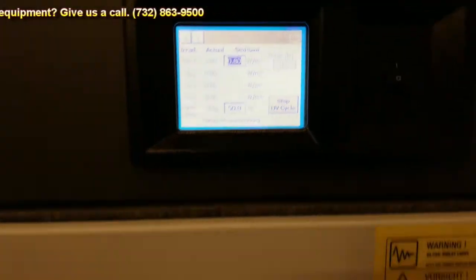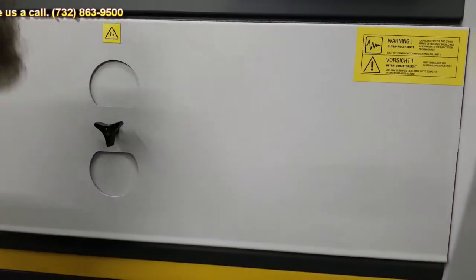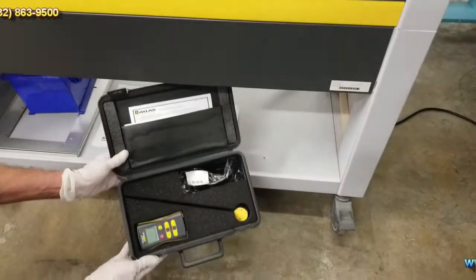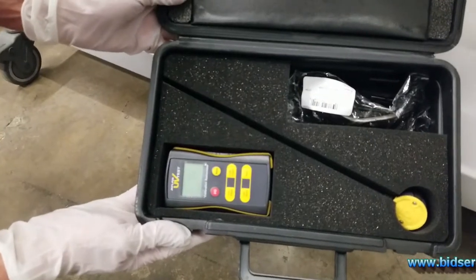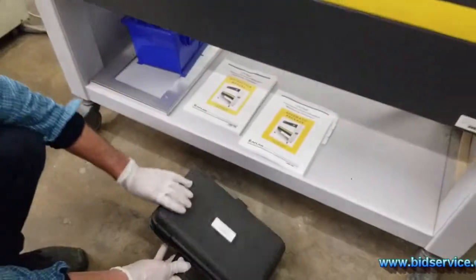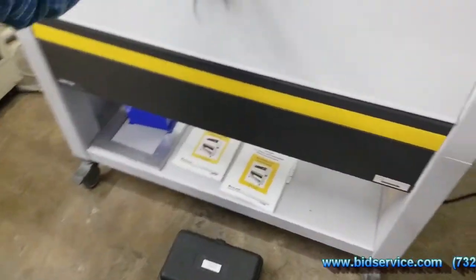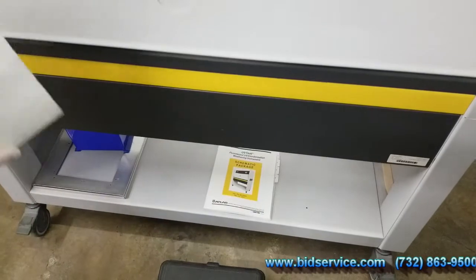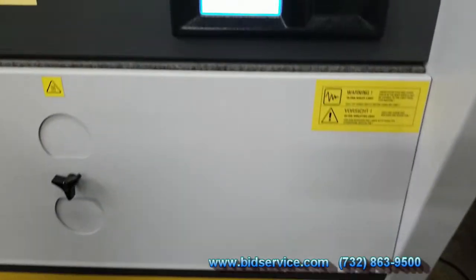You'll receive an instruction manual, and I did the calibration as per the manual — this is the calibration set that you'll receive. Basically you open these panels; it's explained in the manual how to do it. We'll come back in a little while and I'll do the humidity test.